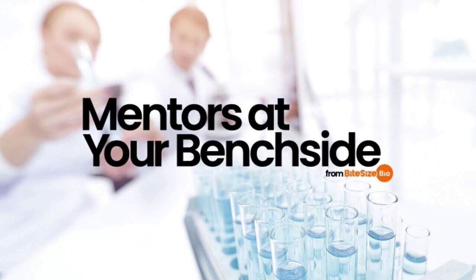Number 9. Losing the pellet. Isopropanol pellets are glassy and clear and difficult to see. The best practice is to mark the side of the tube where you expect the pellet to form after centrifugation in a fixed angle rotor, so when you decant the isopropanol, you know where to look.